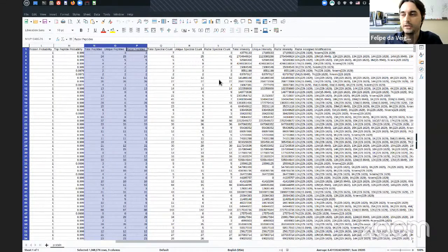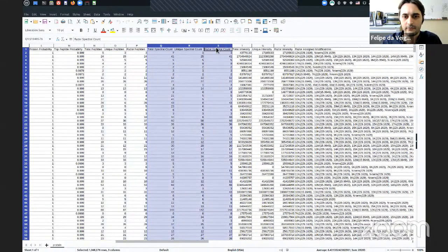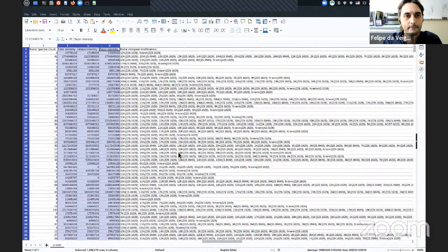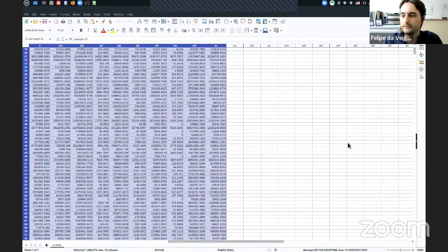We divide them by total, unique, and razor, meaning that total is just the whole summation of all peptides. Unique is just the peptides that map uniquely to that protein. And razor is unique plus razor, meaning that you're going to see unique peptides plus the shareable ones that got assigned exclusively to this protein. Same thing for spectral counts, if you want to check the spectral counting, and the MS1 intensity as well. Then the list of all modifications from all peptides mapping to that protein. And here at the very end again, the TMT labels with the intensities.